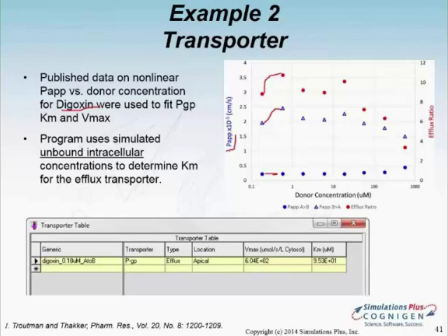Looking at any particle effects, different types of processes and properties would be important aspects, and we have not looked into the particles themselves. There are still a lot of issues that we are trying to solve with the APIs alone. So other than reparametrizing or finding some workarounds and changing some of the parameters, it's not really an out-of-box solution. It's not really targeted towards nanoparticle-type absorption.